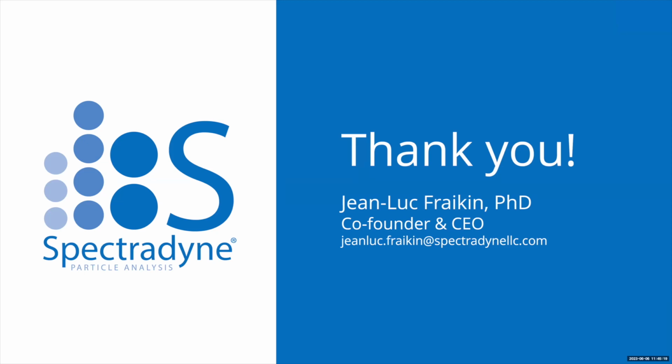Good question, Dennis. The ARC is basically identical to the NCS1 you already have, so the detection via MRPS is identical. You can think of ARC as a cross between an NCS1 and a flow cytometer, which is a very oversimplified answer. As far as LNP stability with Tween, we do have other surfactants that we've tried that work.